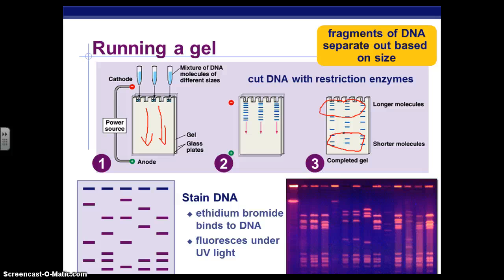Then you need to stain the gel. But just by running the gel, you can't visualize the DNA. The DNA is actually clear in color. So you have to stain the gel so that you can see the DNA.